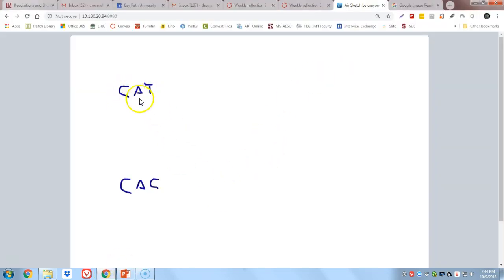When I say we design a single primer, that's a misnomer. It's a misstatement in a way. We're actually designing 2 primers. Remember, it's a heterogeneous mix of many primers. One of the primers in our mix will start CAT, and the other primer will start CAC. Since those are the only 2 codons for histidine, we know that one of those 2 primers will anneal to the first 3 nucleotides of our gene. We just don't know which one of these will be the one that works.